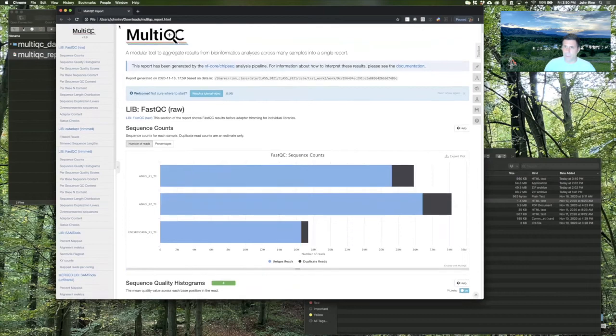ChIP-seq. So that's handy: all of those things would be done in different programs and different output files for each sample, and Nextflow has put this all together for you, so that whatever you've run, it'll put it all together. You can watch a video tutorial on other aspects of this and go through these different files and get familiar with the file types and the sort of metrics that we briefly went over in the previous video, that Nextflow is making sure to use programs to make sure your data is high quality.